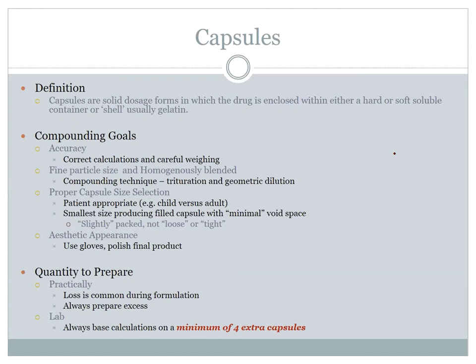I say that because, hopefully if you watched the video, you know you're going to open up the capsule, you have your little powder, and you punch it up and down, up and down, and then you put the cap on, and then you weigh it. You have to get the right amount of powder into the capsule. At first, it takes you a while to figure that out. You may put too much, and then you take some out. And then it's not enough, so you have to put more in.